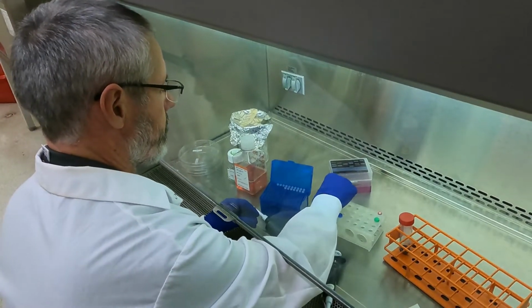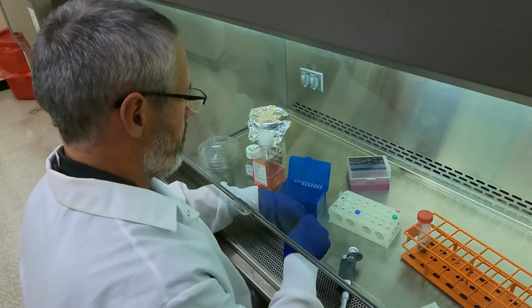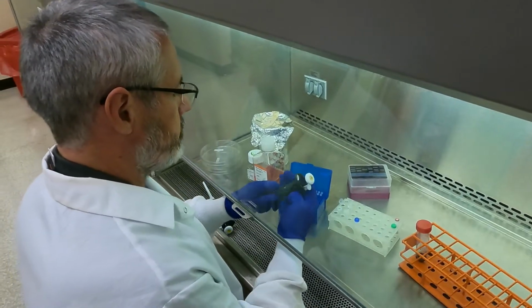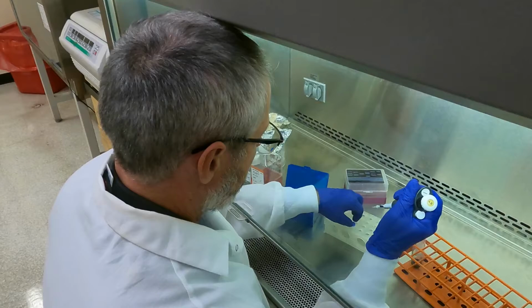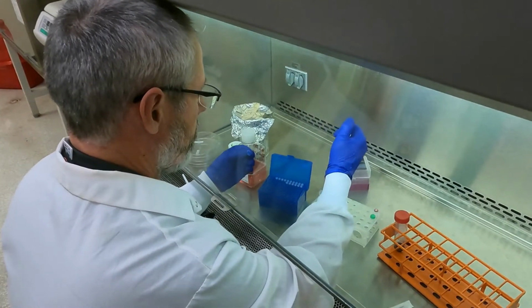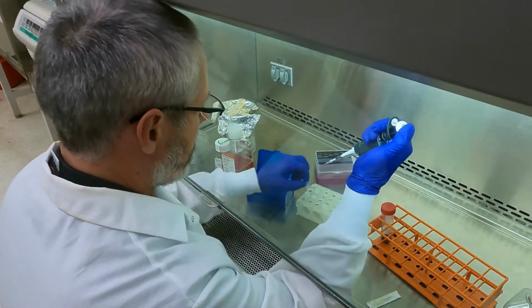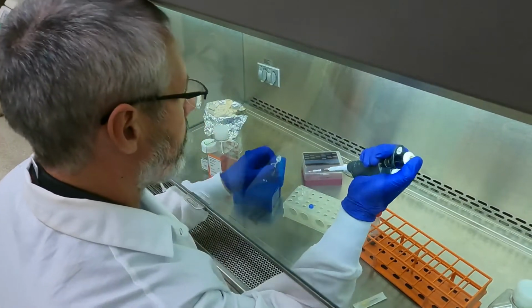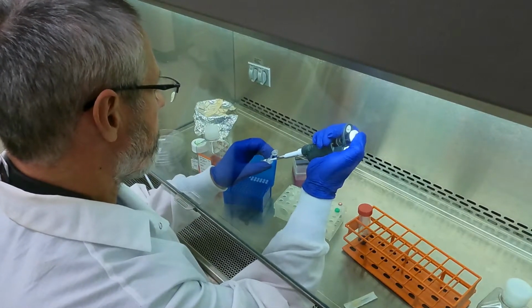C16. Down to the bottom and squeeze it in.